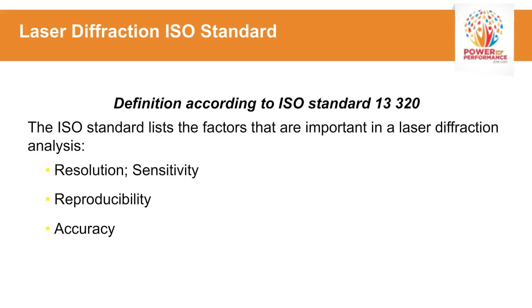Brief discussion on ISO standards. ISO standard 13320 discusses some key factors that are important for laser diffraction that one wants to consider in their design. ISO took these into consideration. So, resolution and sensitivity of the result.